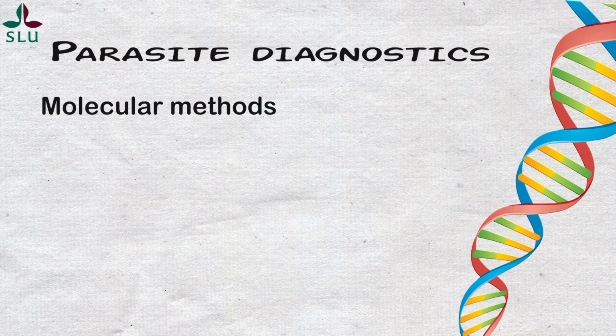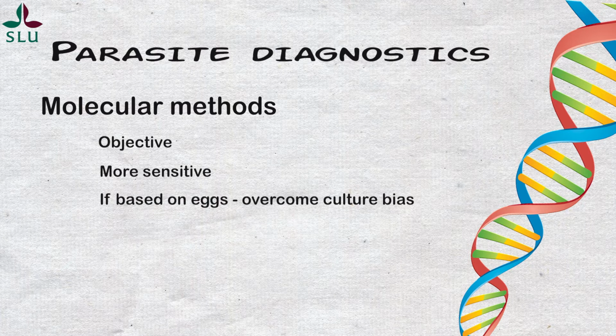In contrast, the DNA-based tests are not investigator dependent and therefore more objective. But they also allow for more sensitive distinction among the different worms present. So these tests provide farmers and their advisors with more confidence regarding decisions related to treatment and parasite control.